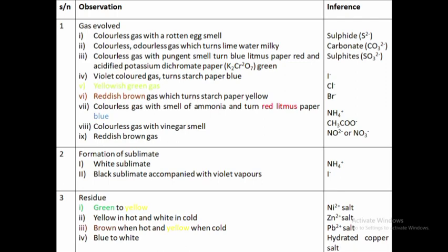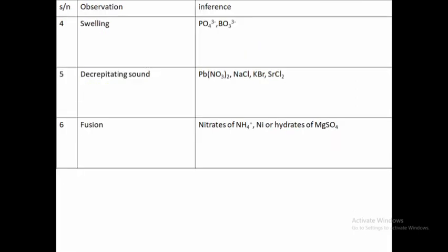Some mixtures melt, meaning they undergo fusion. These salts dissolve in their own water of crystallization and appear to have melted. Some salts make a creaking sound. Creaking noise means the salt doesn't have natural water of crystallization, while some swell.